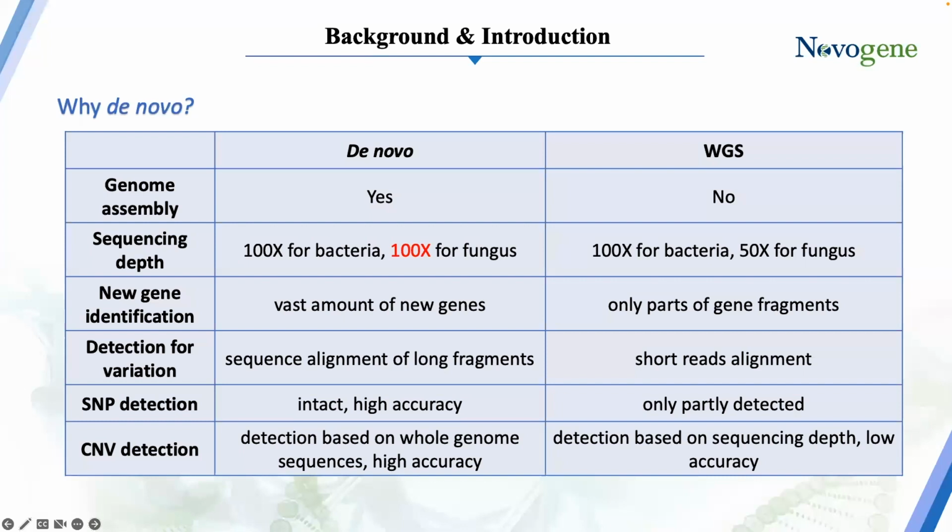And also, if you have a sample like a fungus that is known to be highly heterozygous, you'll be able to phase alleles into the different chromosomes too with enough coverage. But for this, you require longer reads. And so outside of this discussion about resequencing, where we have a reference genome, you may want to consider going towards PacBio or long read sequencing, along with possibly some Illumina sequencing to build your de novo reference.